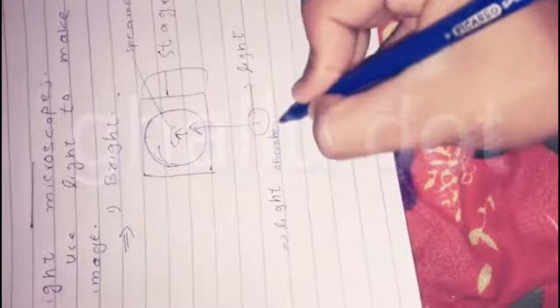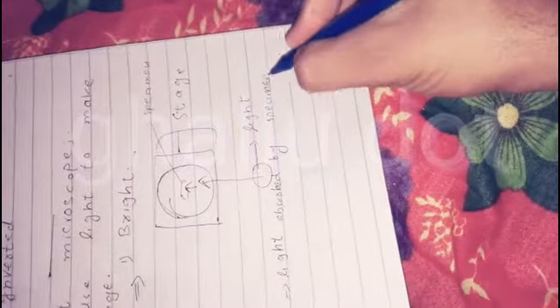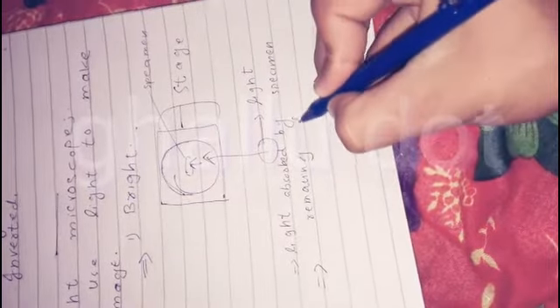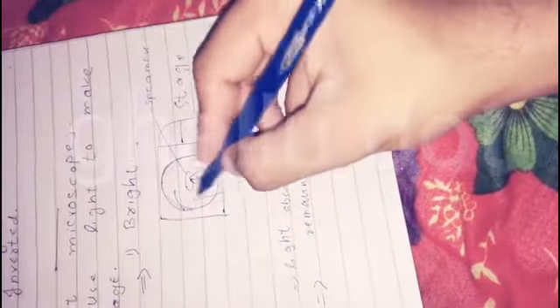The dense area will be black, and in this way we can differentiate different contrast on the object which is absorbing the light.